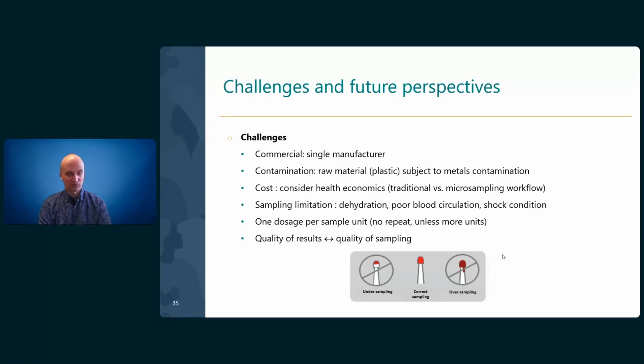The sampling limitation is also challenging. This approach might apply to most patients, but in some cases it becomes limited. For example, when patients suffer from dehydration, poor blood circulation, or shock condition.